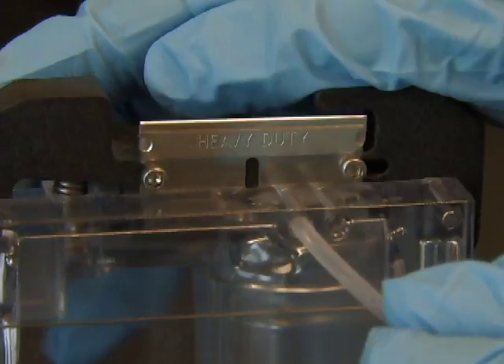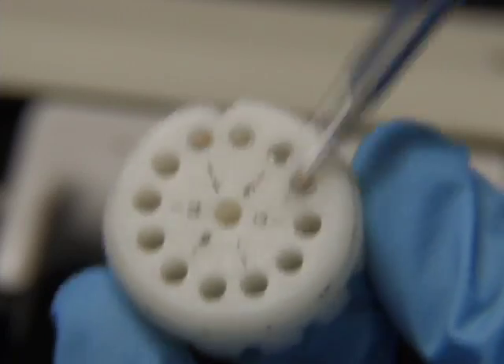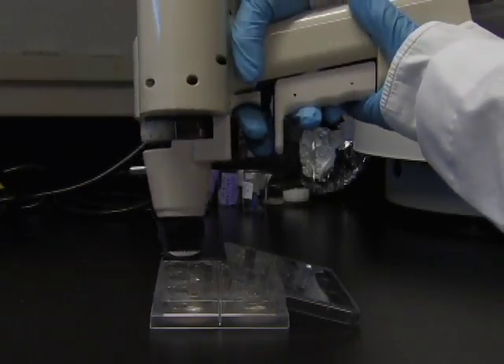Three, cut the tubing into cartridges to load into the gene gun; and four, shoot the tissue to be transfected.